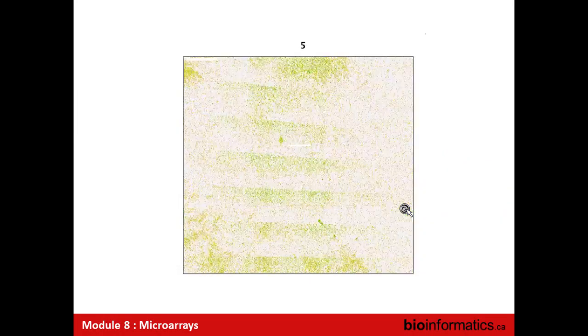Similarly, if we take a look at a very interesting experiment that we did, you can see what Christian mentioned a few minutes ago, a line here. That's weird. Why is there that line here? Well, this was the third array in our experiment. The fifth array, you can see 1, 2, 3, 4, 5, 6 lines. That's weird. By the eighth array, you can see a lot of lines. Anybody know what's going on and why we have all these lines in our experiment and we're getting more and more as we go on?